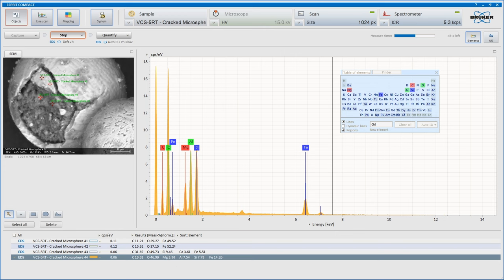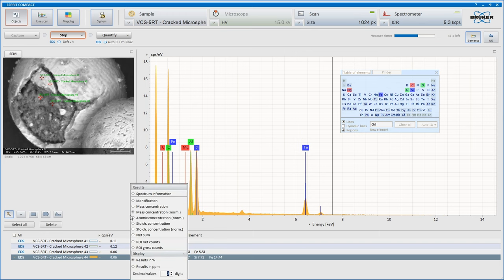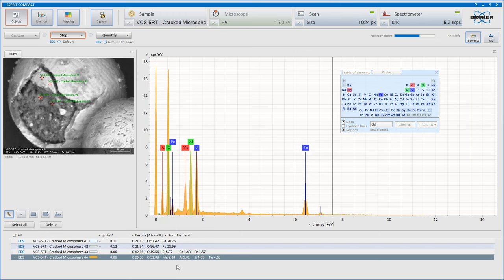It is seeing magnesium, it is seeing aluminium, and it is seeing silicon. And if we look at atomic concentration here, there's as much, or if not more, silicon than iron. There's more aluminium than iron, and there's half as much magnesium. Very interesting internal contents here. Yeah. See? Order of magnitude more counts per second by rotating the sample.